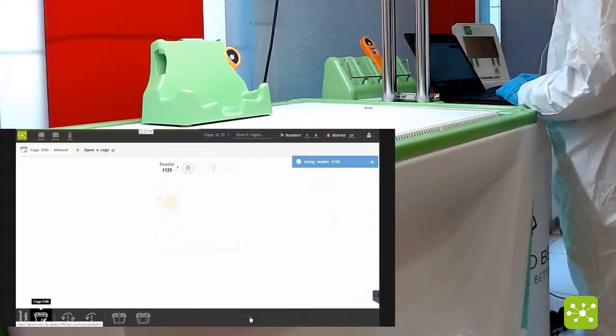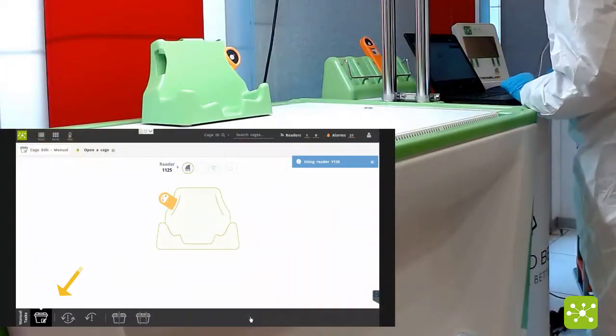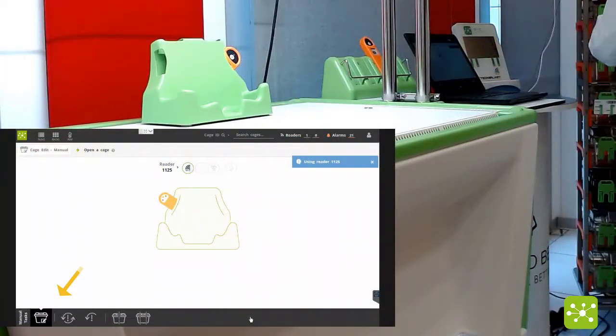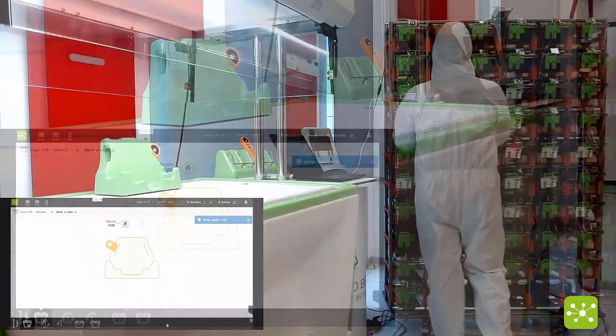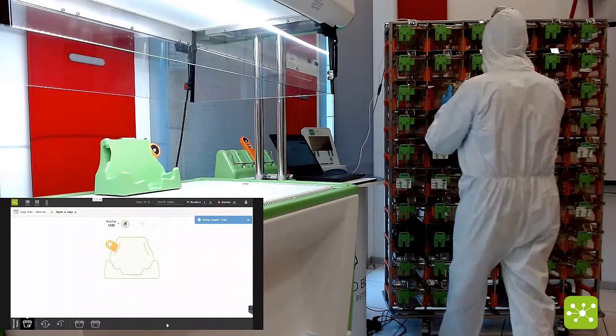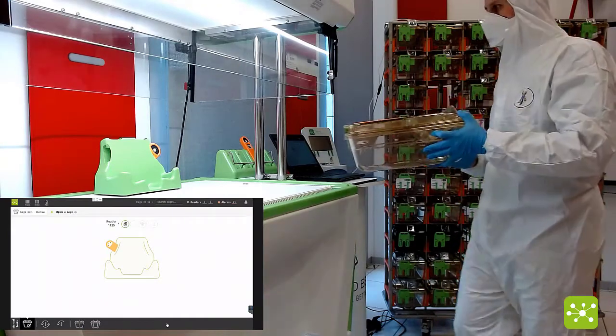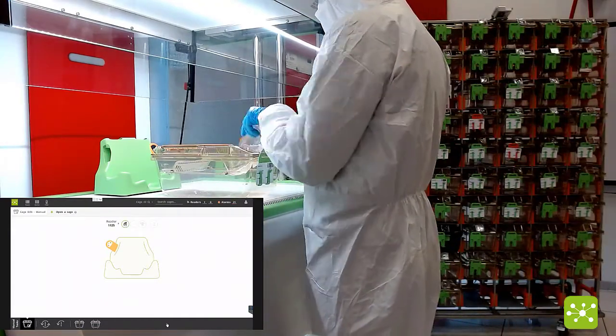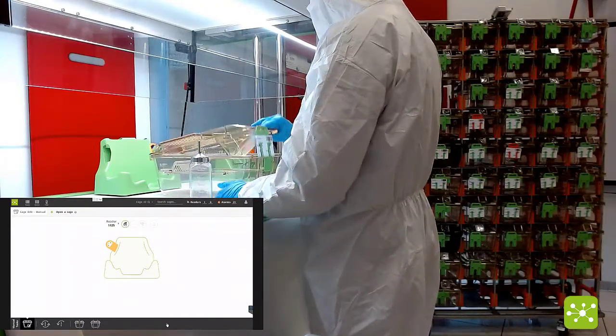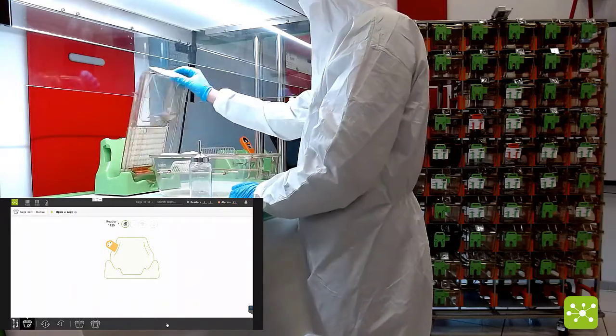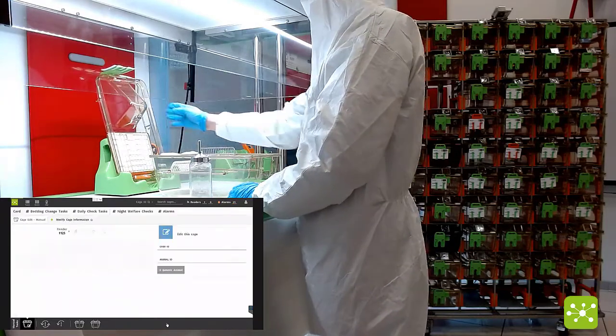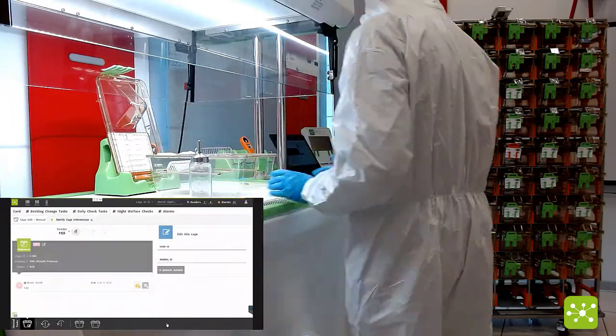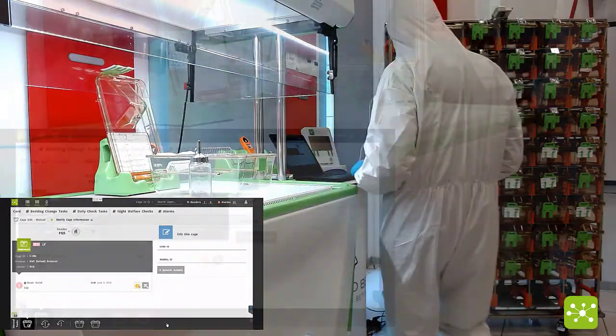First step you have to click on the cage edit button, take the cage, open it over the corresponding already assigned RFID reader.